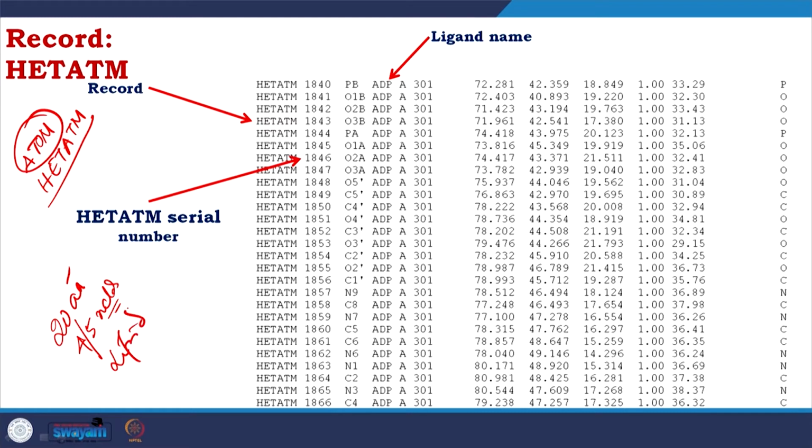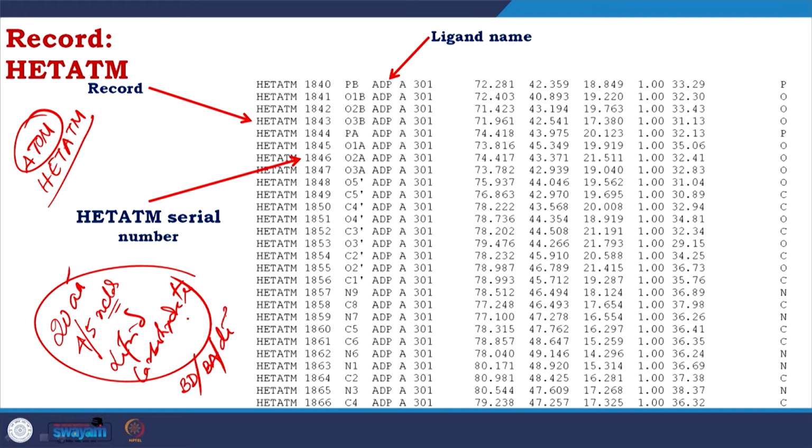There are lipid molecules, there are carbohydrates. We have discussed them and you know all of them, right? So, is it possible to know about their bond distance, bond angle, dihedral and all those informations? Yes. All those informations are collected in a library. So, when you bring any protein, the protein's geometrical character is already there in the software in the form of a standard library. Clear?